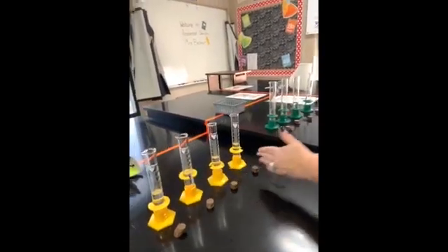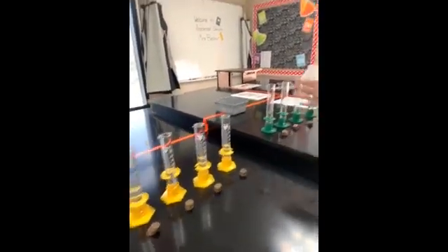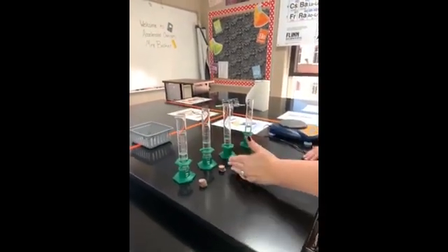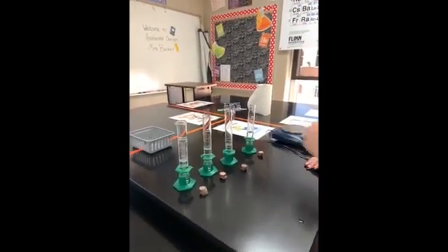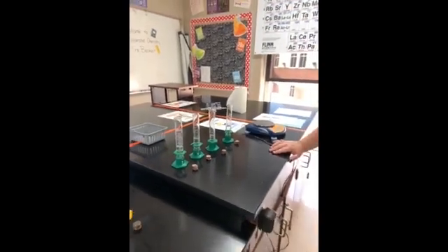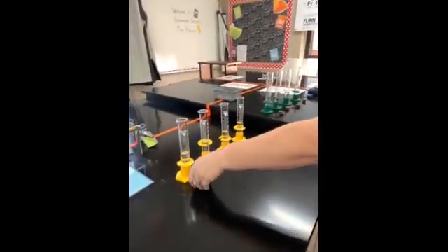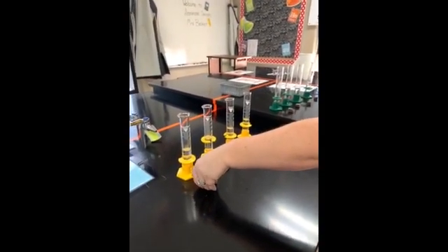So I have my pre-82 pennies. I have trial 1, 2, 3, and 4. Over here, I have the post-82 pennies. Again, trial 1, 2, 3, and 4. So the first thing that we're going to do is take the mass data. So here we go, pre-82 pennies.